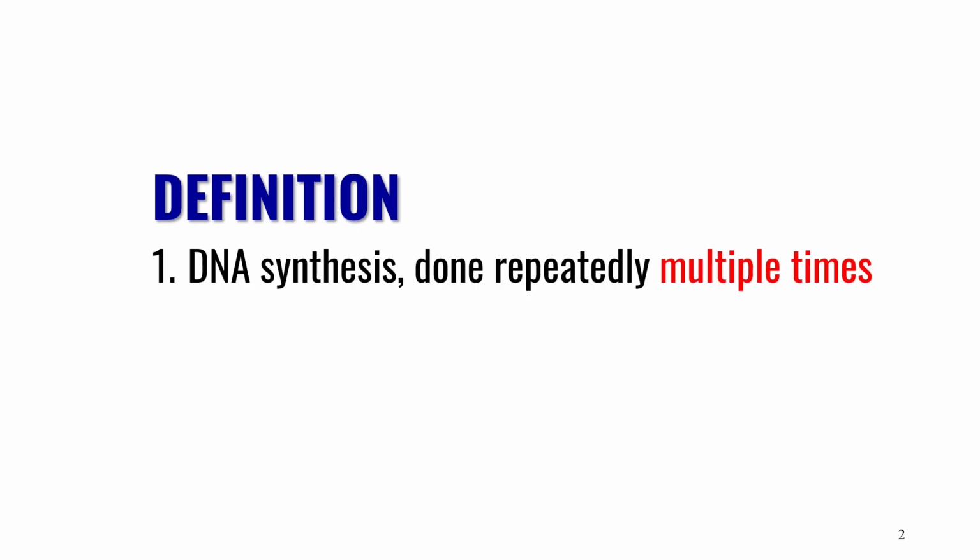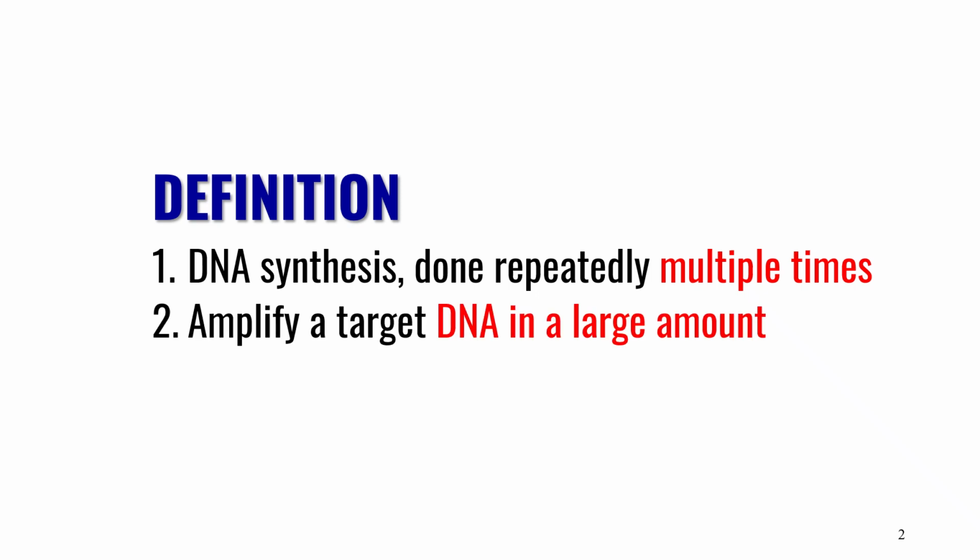So what is PCR? How do you define PCR? As the name indicates, polymerase chain means repetition of DNA synthesis reaction again and again in a cyclic manner using the same reaction mixture. Normally, an enzyme reaction cannot be repeated using the same reaction mixture again and again, but it occurs in PCR normally. Therefore, PCR is defined as DNA synthesis done repeatedly multiple times to amplify a target DNA in large amount.